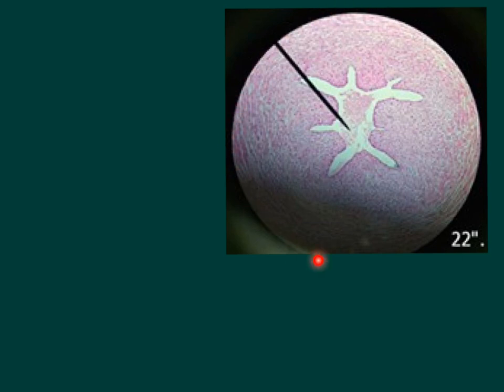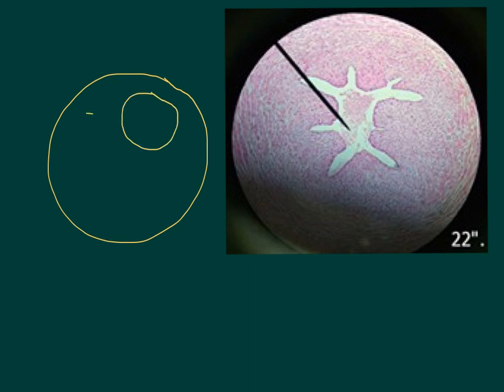This is one of the two arteries, and they look as the eye in the face. So in case of the umbilical cord, the cord appears as if it is a face with two eyes, which are the arteries, and the vein, which is the mouth.